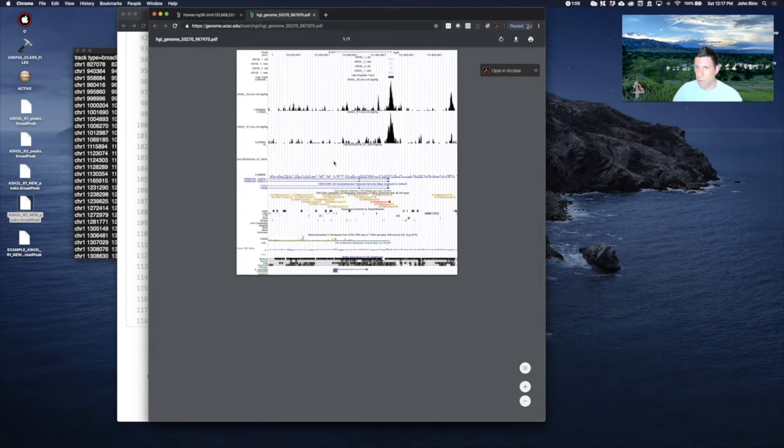And so with really running this through Nextflow and of course the ChIP-seq pipeline, you got all the output files you needed. For lab meeting, you can probably present all the QC results, some quick browser shots, and things like this. So it's really just a couple things you have to think about, and you can get really far into already starting to make figures. And we can suggest here this gene we like a lot, ASH2L, is at its promoter very, very specifically, or very well represented at its promoter.